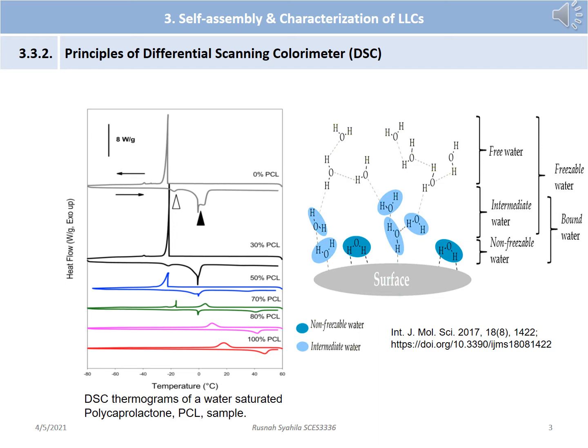The melting temperature of freezable bound water is usually lower than bulk water due to hydrogen bonding, but changes slightly or remains constant with different ratios in sample and water mixtures. In some cases, a cold crystallization peak appears on the heating cycle for an intermediate water concentration range. That is mainly due to some water molecules being unable to crystallize completely, yielding a higher fraction of water molecules that are non-freezable under the experimental condition.